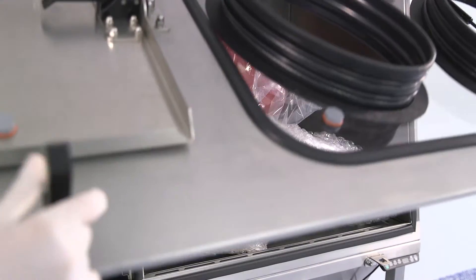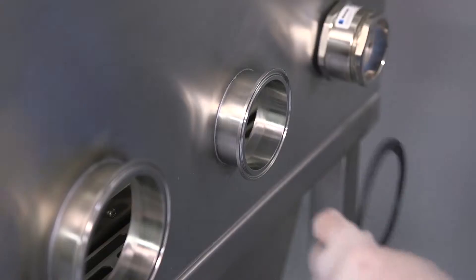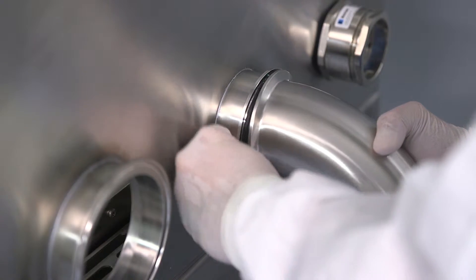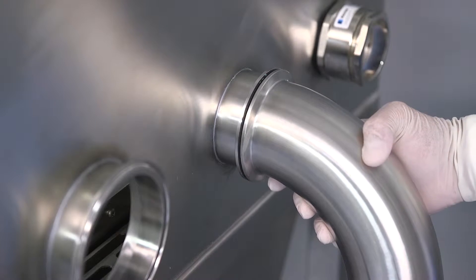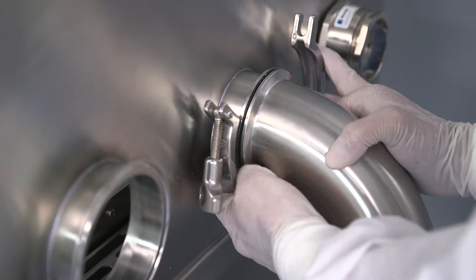Your Versaflow is shipped with gloves, sleeves, cleaning supplies, and rubber stoppers inside the cabinet. To install the stainless steel sharps discharge tube, place the gasket between the flange and the discharge tube. Use the stainless steel clamp to hold it in place.